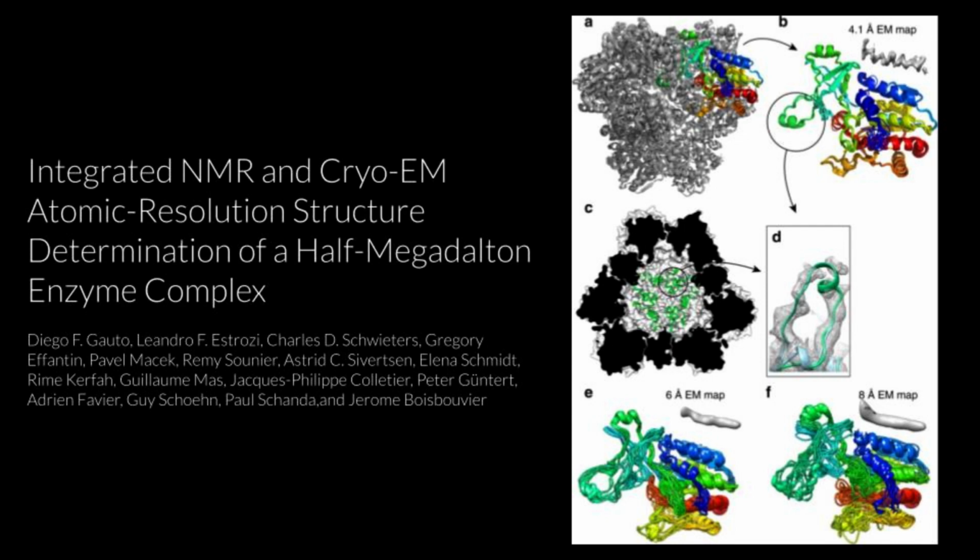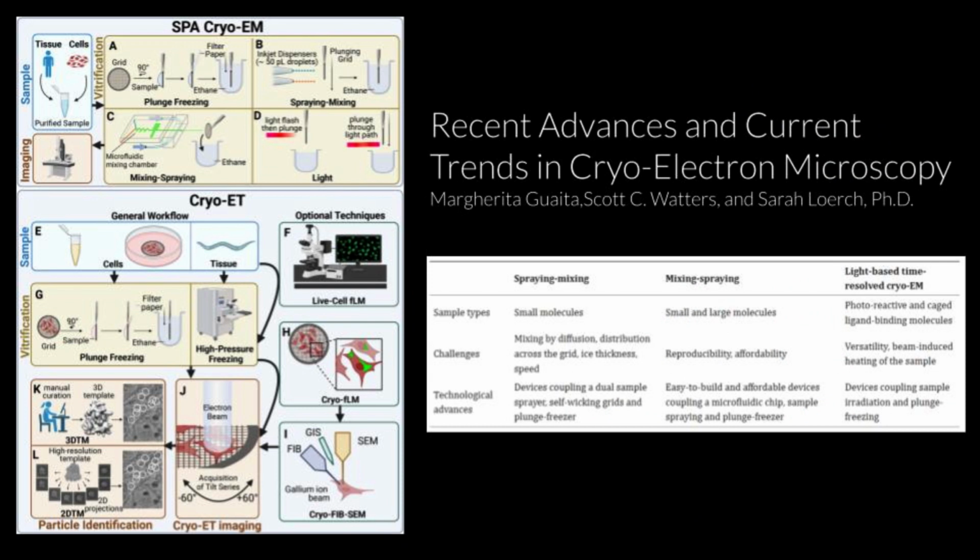Since this is such a rapidly evolving method, I wanted to include a manuscript that highlighted more of the recent advancements in both single particle analysis, cryo-EM, and cryo-electron tomography. These have facilitated the determination of higher resolution biomolecular structures that are not available with other methods. This specific study reviewed the current developments in SPA cryo-EM and cryo-ET that push these boundaries.